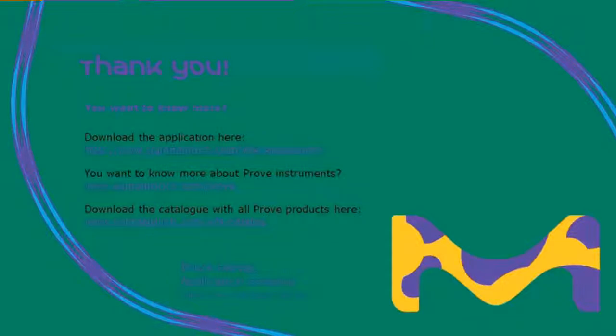Okay, thank you, Bruce. And I think the final question we have is, for a user-defined calibration, how many calibration points should be done? Okay, well, as you saw in our presentation, we did 10 points. But generally, if you have 5 points, that's an acceptable amount to get a good linear calibration. It's really up to the user and their internal processes, what kind of choices they make on the number of calibration points. But we wouldn't recommend anything less than 5 typically.